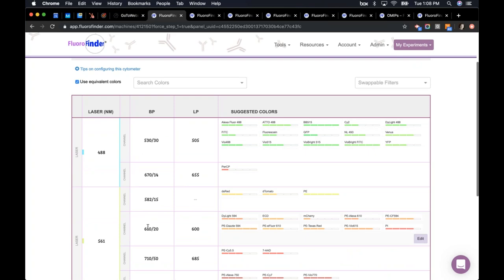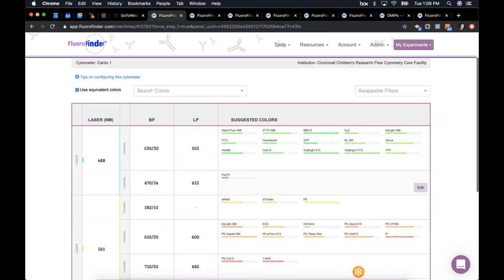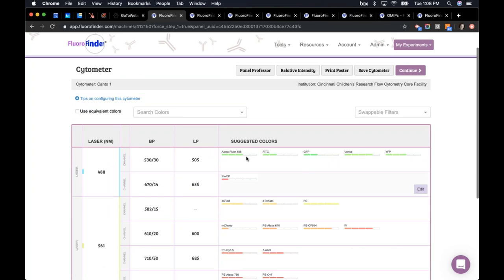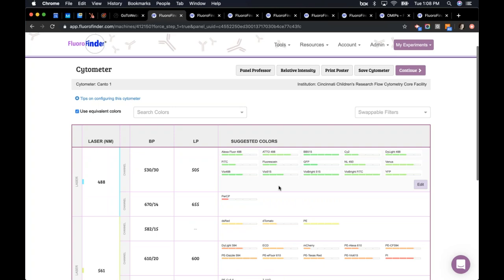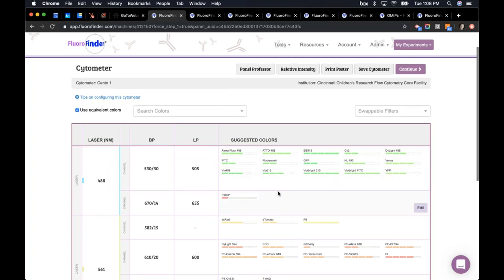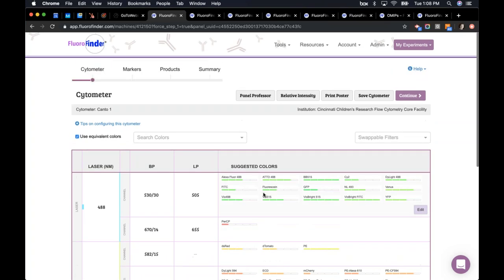The first thing here is to select an instrument and click on view configuration. We have our lasers down the left-hand side, our filters and long pass filters. We have colors that are suggested by the core manager or whoever sets up the machine. FloraFinder adds different equivalent colors to each channel, and as you go through the panel design process, we're even going to show you products for additional colors beyond what's shown here.